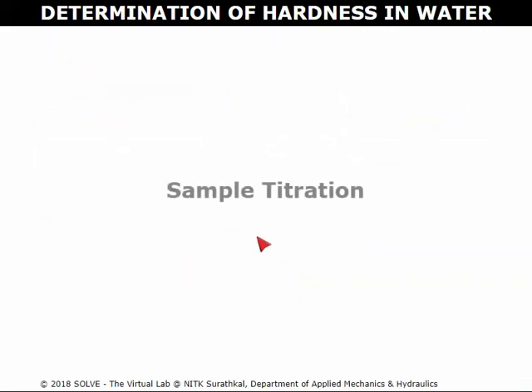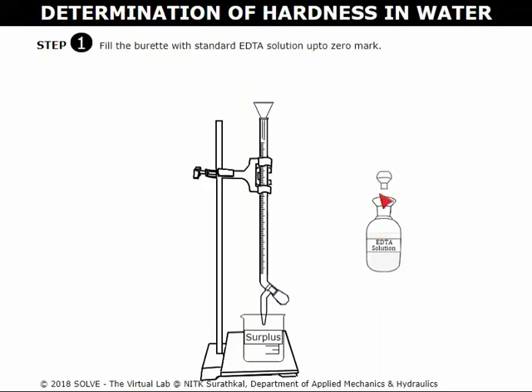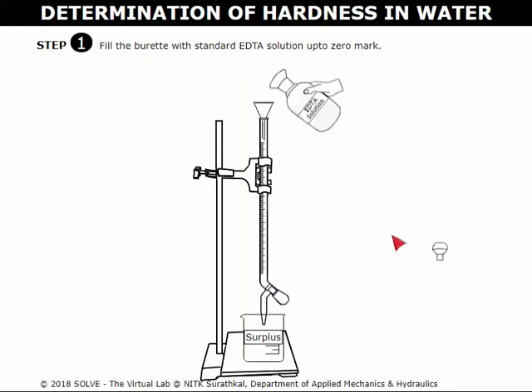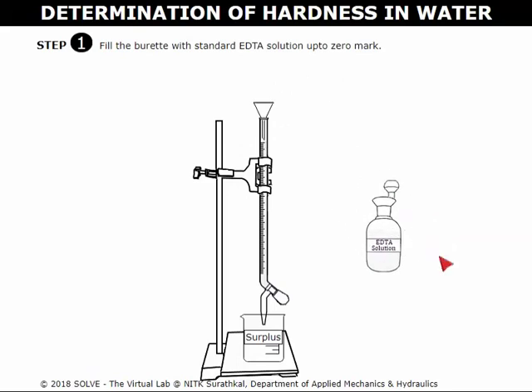Sample titration. Click here to place the funnel into the burette. Click here to open the EDTA solution. Click on the solution to transfer it into the burette up to zero mark. Click on the lid to close the lid. Remove the funnel from the burette.